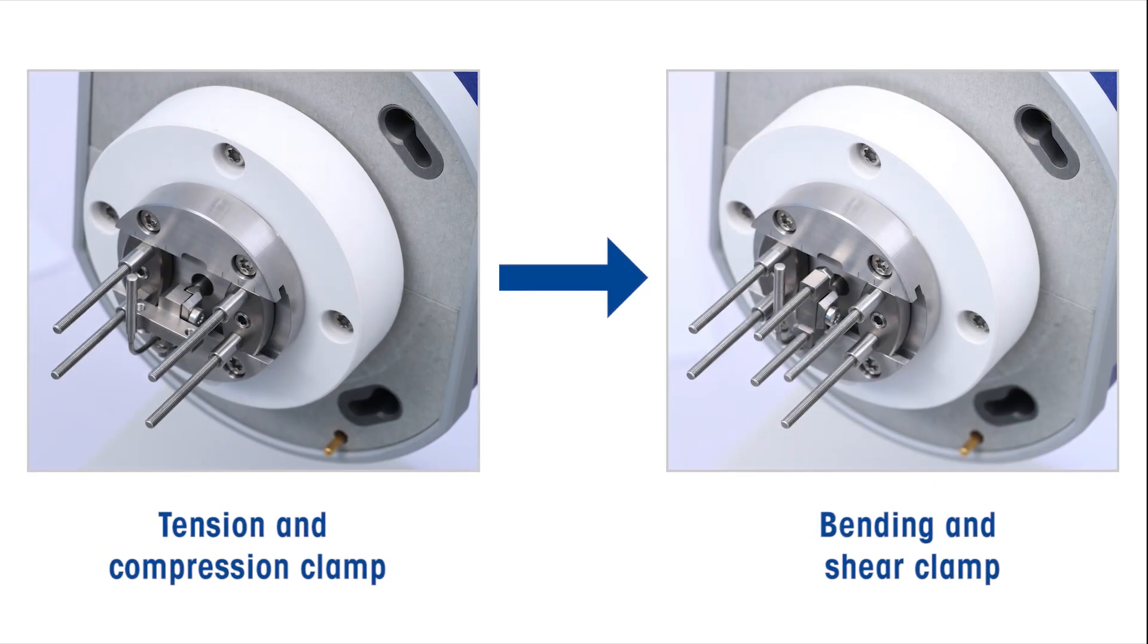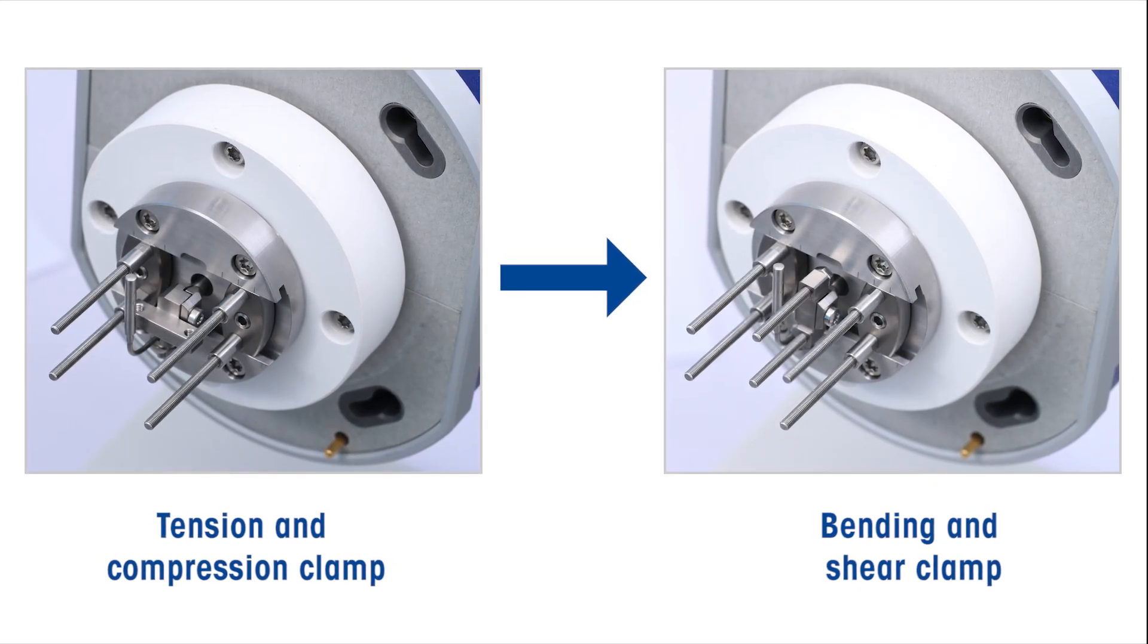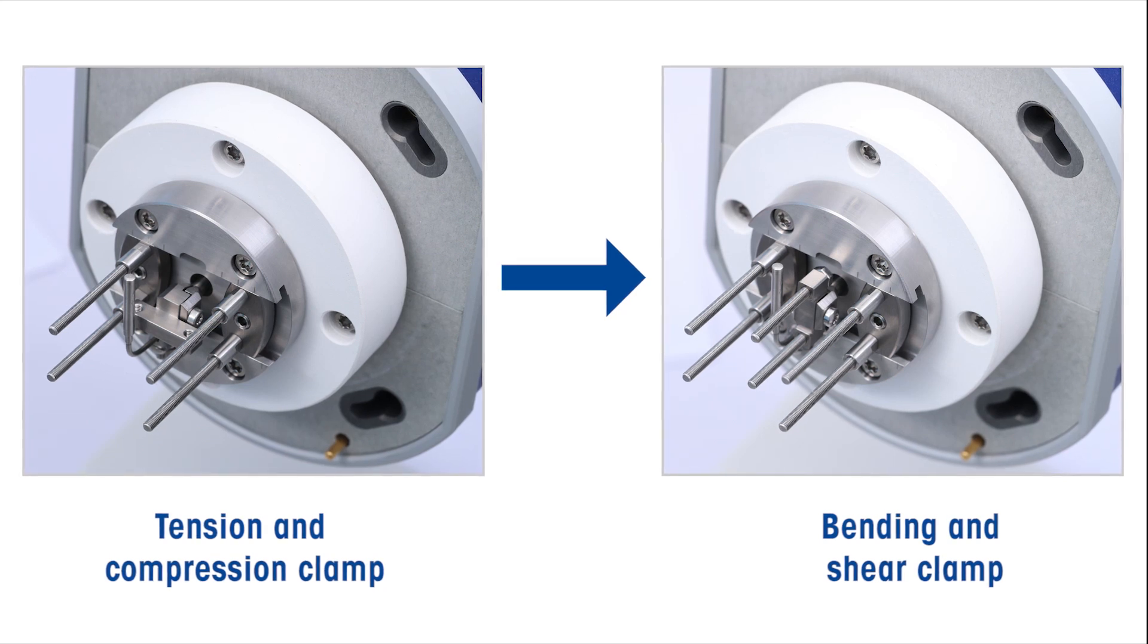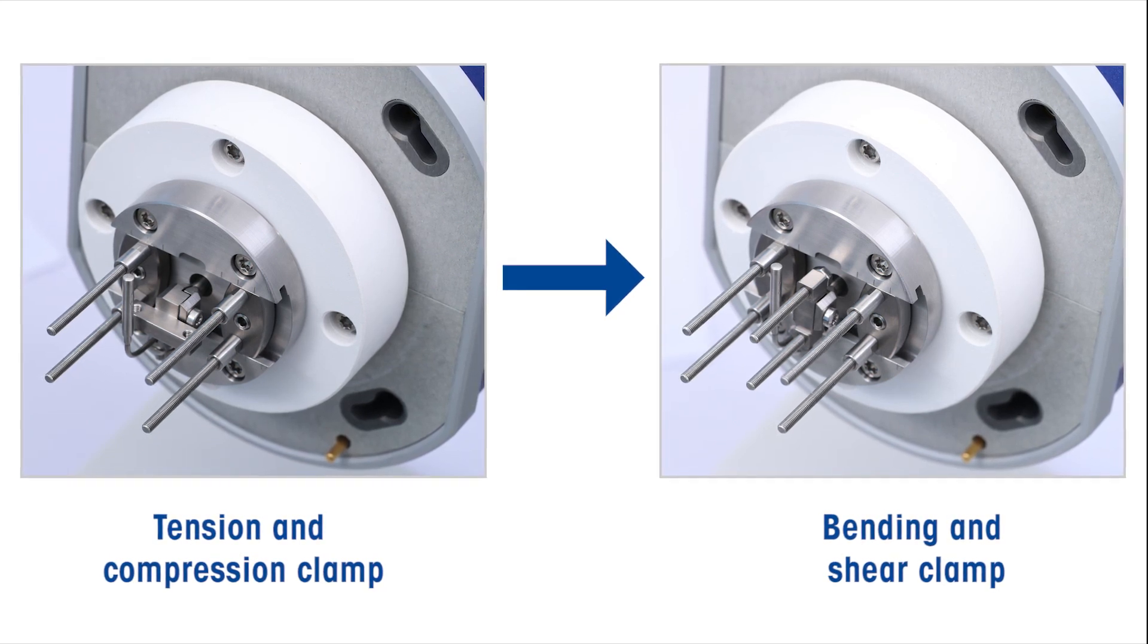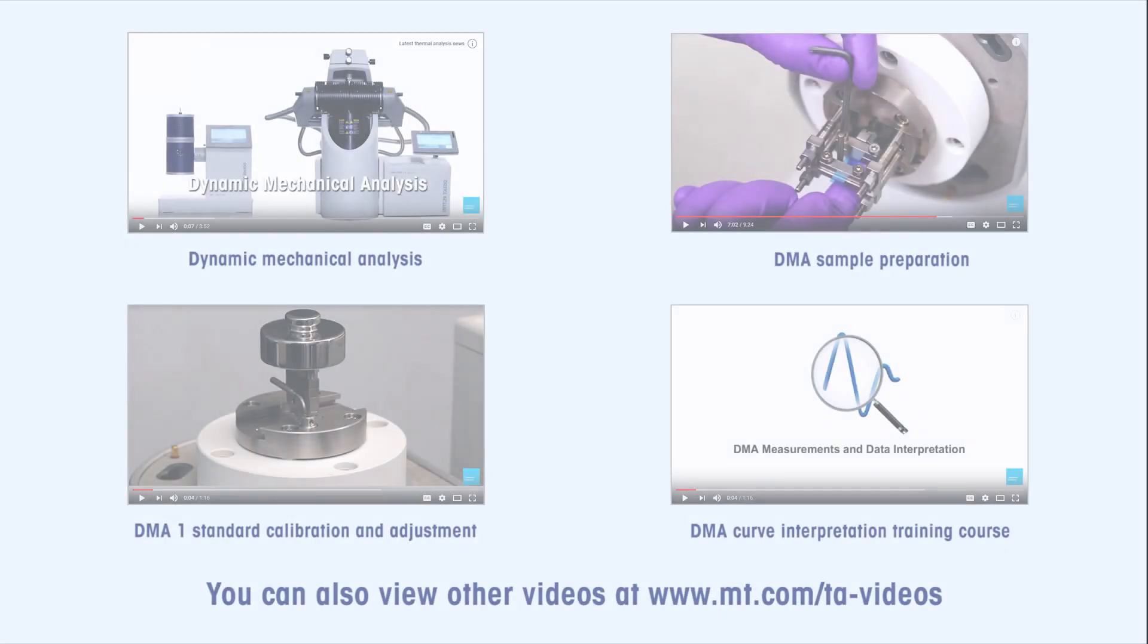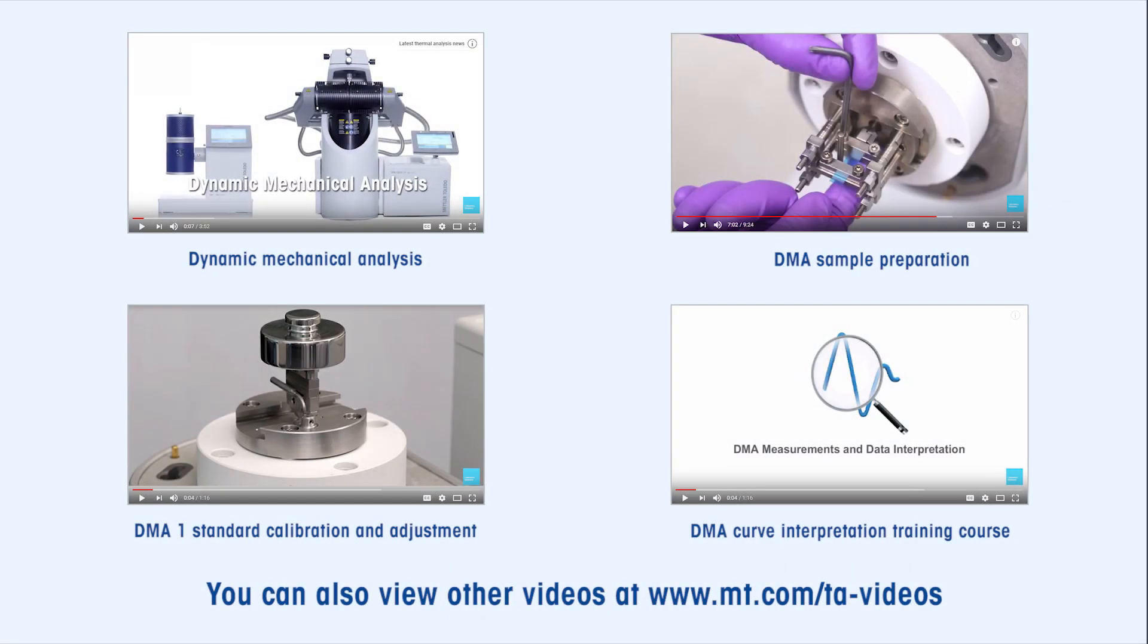By following the reverse process, you can also change a tension and compression drive shaft clamp to a bending and shear drive shaft clamp. For more information on DMA, please watch our how-to videos on YouTube.